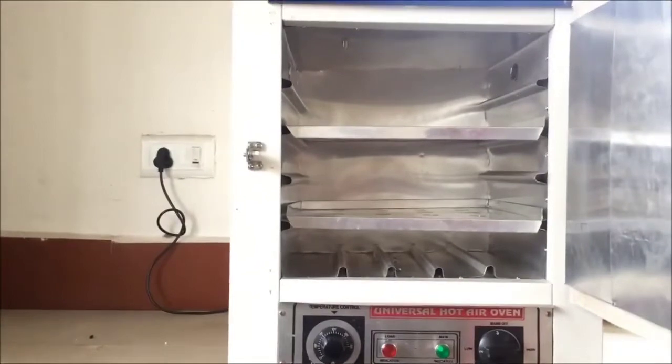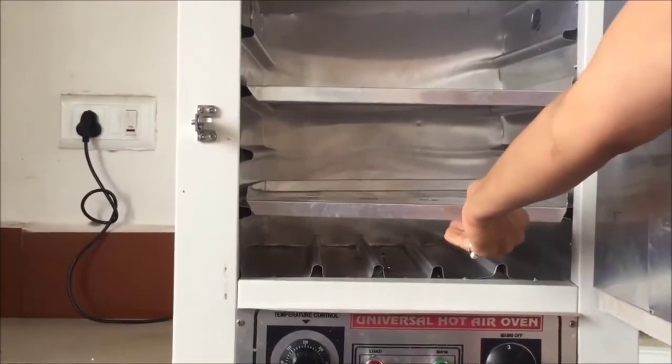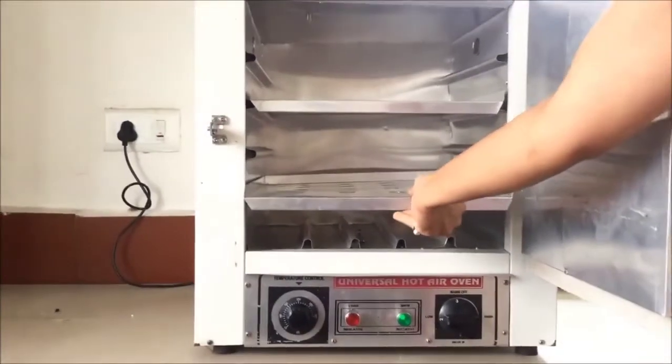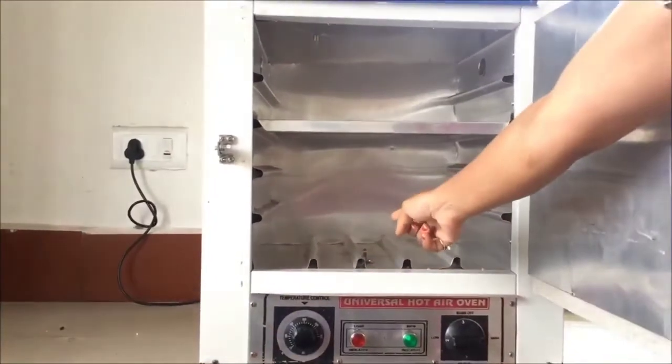Let's see what components are inside the hot air oven. As you can see, there are two racks or trays inside — one on the upper side and one on the lower side. Let's remove them to visualize each part clearly. We are removing the lower tray, which is made of aluminium.